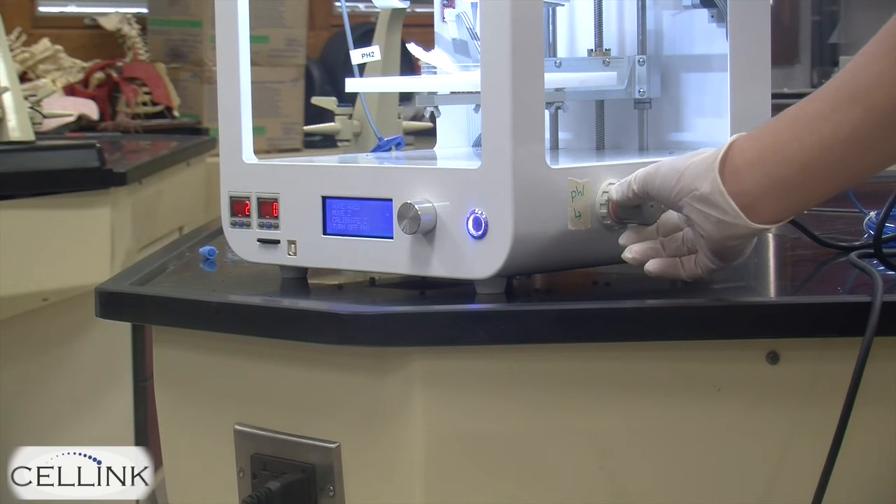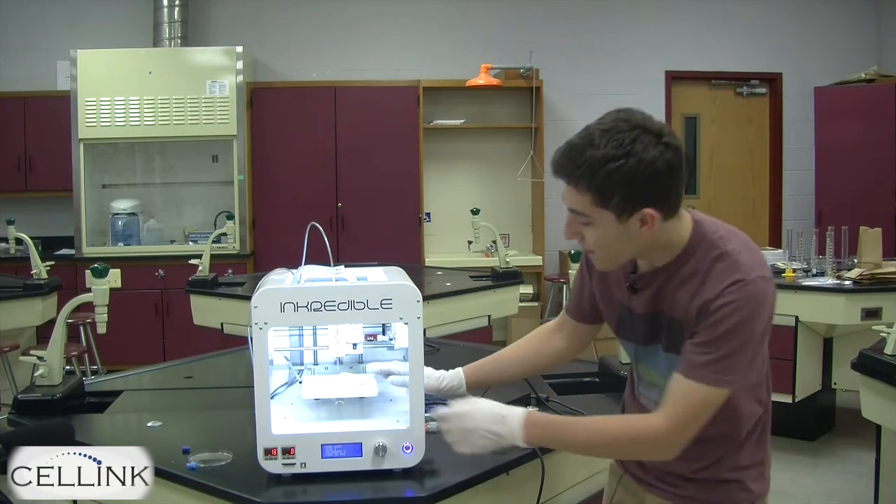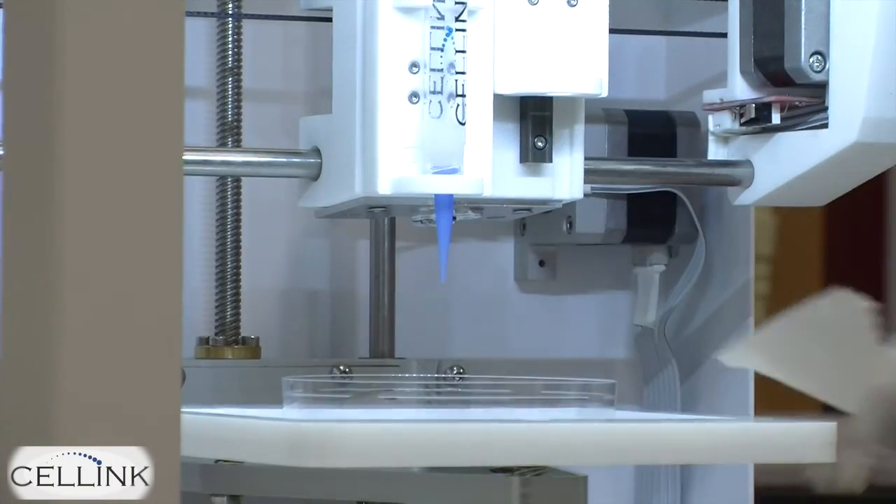Slowly turn the gray knob until you see bio ink being extruded from the print head at a steady rate. Once it's being extruded at a steady rate, use the paper towel to wipe up any excess bio ink.